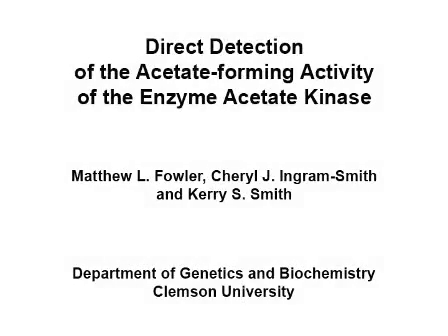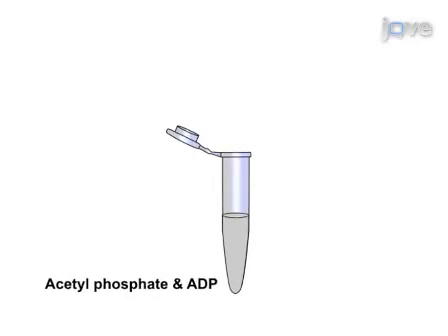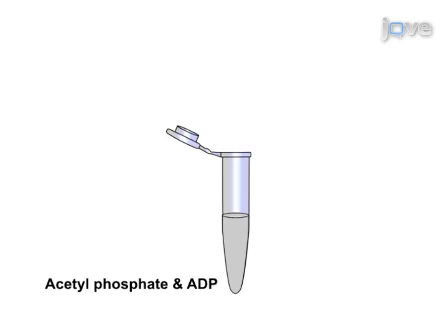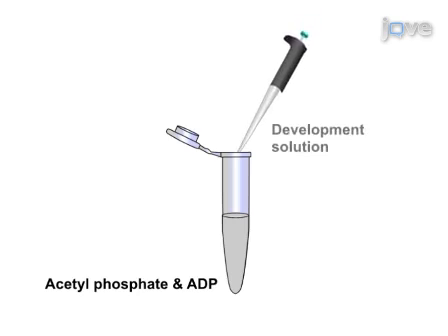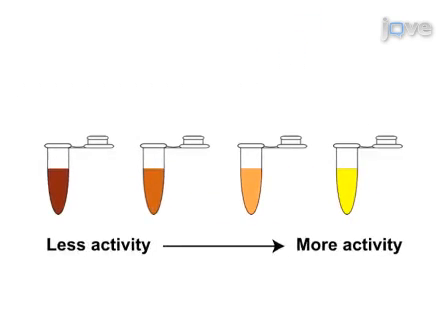This experiment aims for a direct measure of the acetate-forming activity of acetate kinase. Initiate the reaction by adding enzyme to a reaction mixture containing the acetyl phosphate and ADP substrates. Then add hydroxylamine hydrochloride to convert the remaining acetyl phosphate to acetyl hydroxamate. Add development solution to convert the acetyl hydroxamate to a colored ferric hydroxamate complex that can be measured spectrophotometrically.